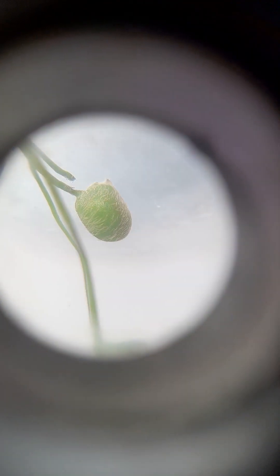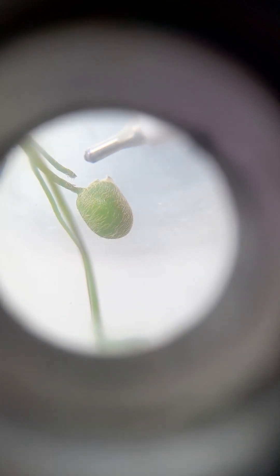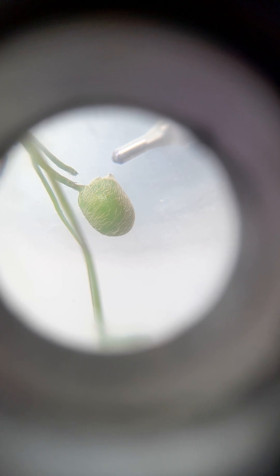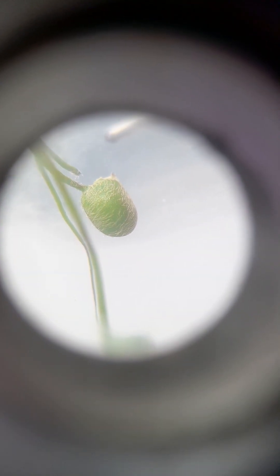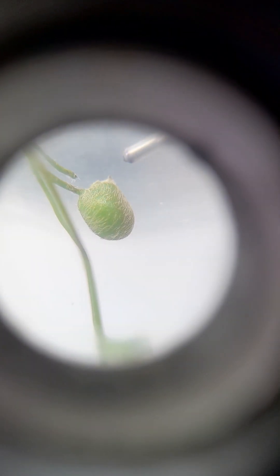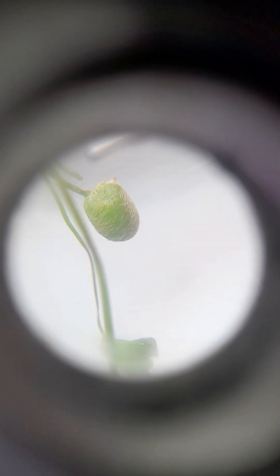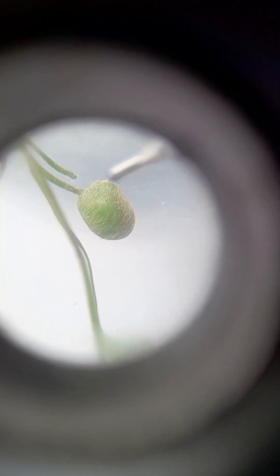Just above the raphe, you can see some swollen tubercle-like structures. Just above the raphe, the body has two dentate projections — dentate means like teeth. Two dentate projections are visible here, and these dentate projections are called tubercles.